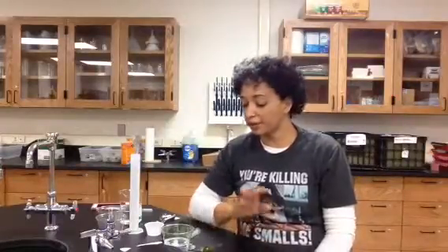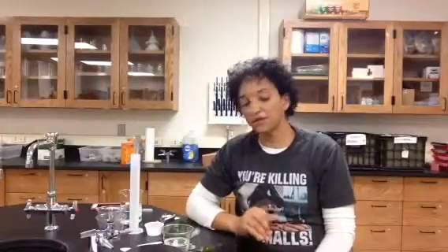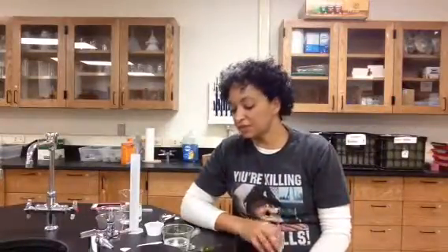And every minute I'm going to count how many leaf chads have risen or how many are in the process of rising. As I'm observing, I'm going to also make some qualitative observations. Maybe some of them are rising faster than others. I'm going to make note of that. So as the leaves are doing photosynthesis, they're creating oxygen as a waste product during those light-dependent reactions. That oxygen is going to collect in the air spaces in the leaves, and our leaf chads are going to float.